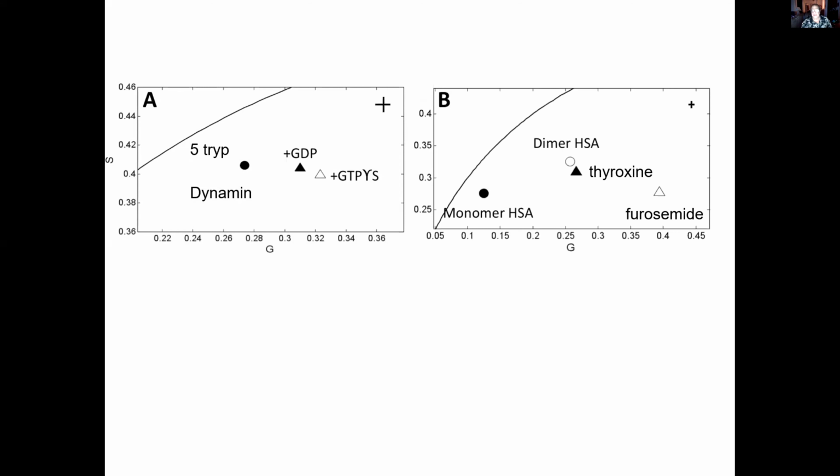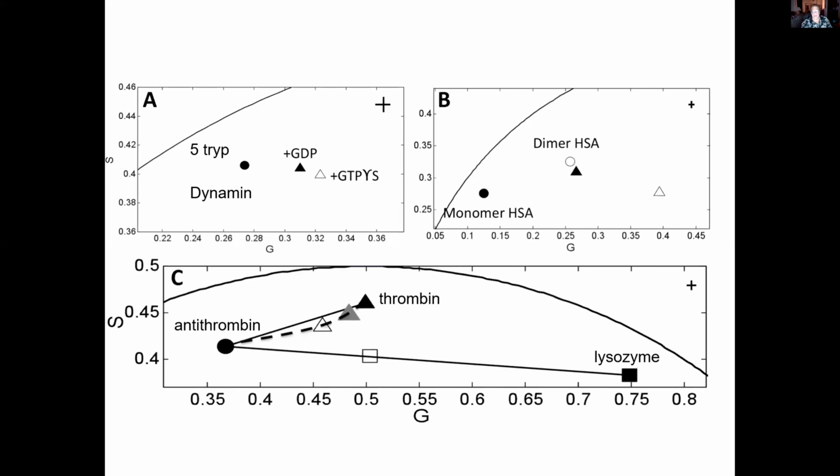Notice I say monomeric because if you buy a mixture and you have the bottle of lyophilized HSA, you have about 50% of dimeric HSA in it. And I point that out because people have done studies they published on the lifetime properties of HSA straight from the bottle, and you can see the dimer is different from the monomer. You can isolate the two on a column.